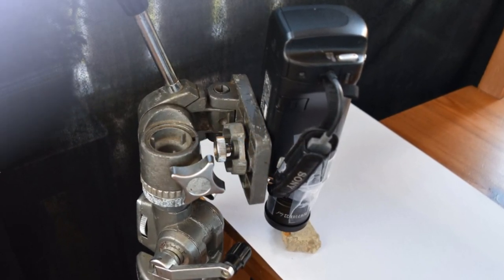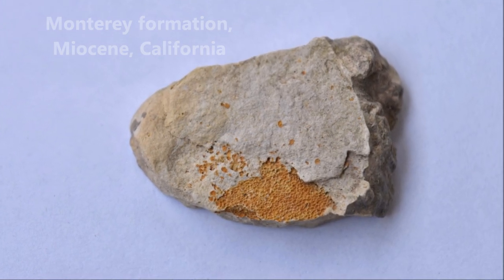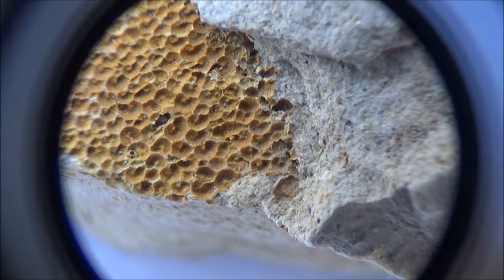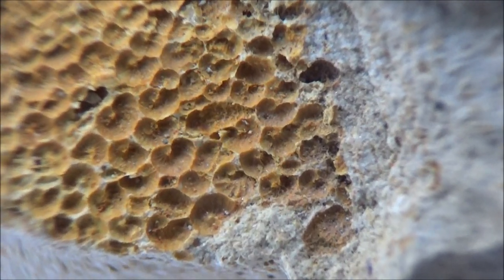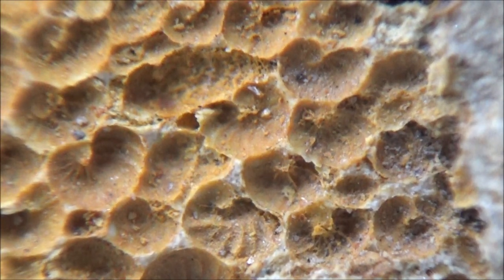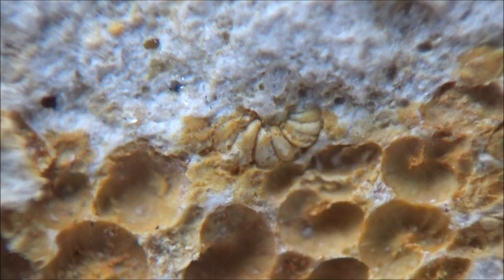For instance, this piece of dolomite with a bunch of round imprints that look like fish eggs to me, but after zooming in it became obvious that those are coiled shells of foraminifera. Surprise!